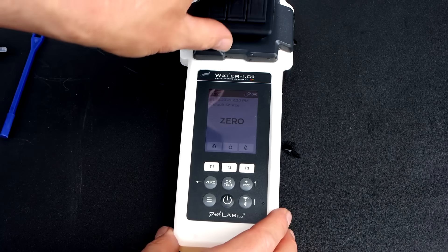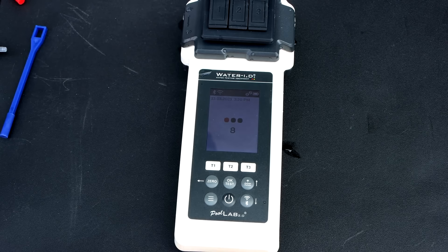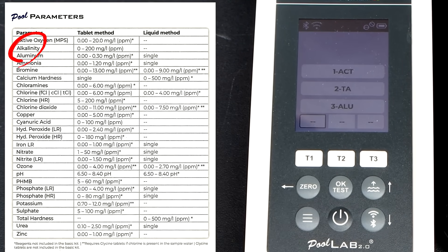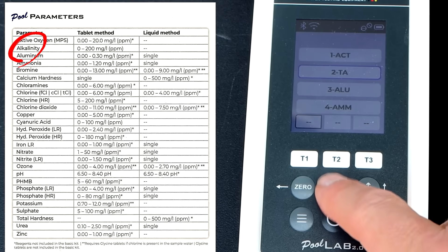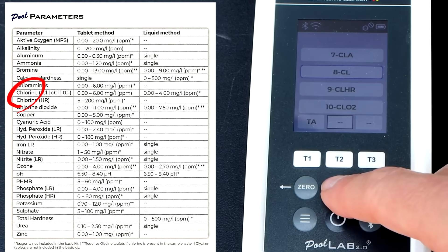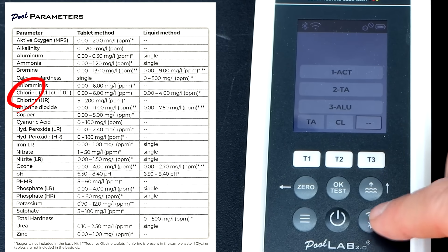I'm going to turn on the unit. Whenever you turn it on for the first time, you want to zero it out. I'm going to do all three tests here. For test one, I'm going to do the total alkalinity. For test two, I'll do the chlorine, and for the third test, I'll do the pH.